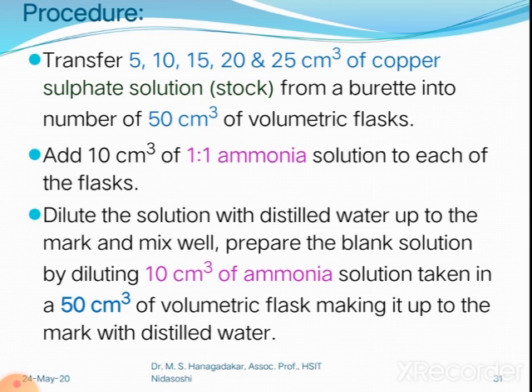In the first volumetric flask, you need to transfer 5 ml of copper sulfate solution.